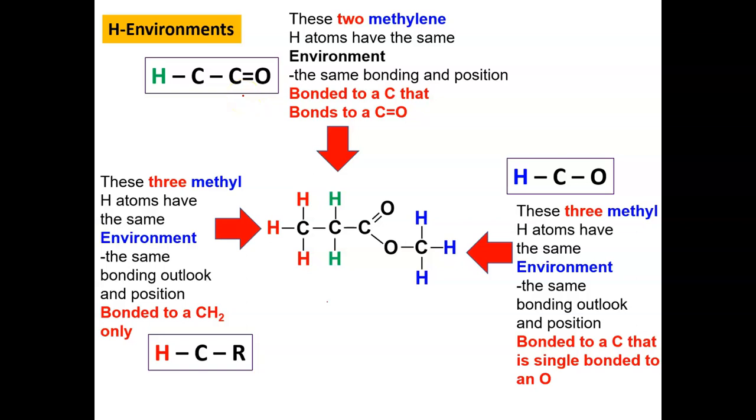If you think carefully, there are plenty of different functional groups and compounds that will contain groups such as that. We're thinking of things like aldehydes or ketones, carboxylic acids, esters, and all the other derivatives like acid anhydrides, acyl chlorides and amides. So this type of hydrogen environment is quite common and very popular in A-level exam questions.